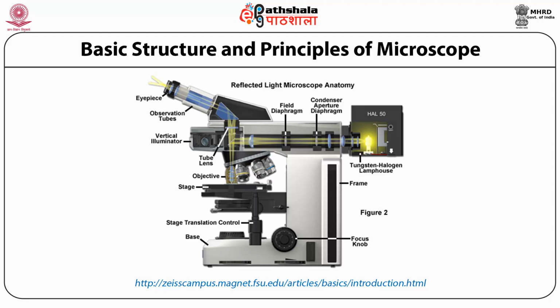When the sample is illuminated, the light is transmitted back through the dichroic mirror as well as the emission filter, and can then be seen through the eyepiece. Also, you will see there is a mechanical stage, which can be rotated and moved in x and y directions, so that the sample can be placed. And there are various other features shown in this picture as well.